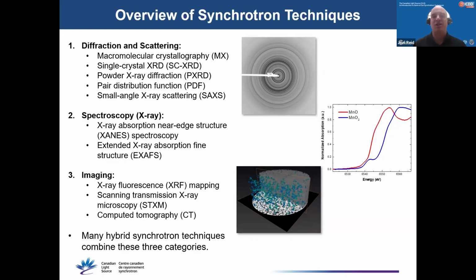Many of these advantages of the synchrotron also lend themselves to hybrid techniques, which blur the lines between these three categories. So I've tried to create some relatively short examples. Some of them are industry-based and some drawing on peer-reviewed research to highlight some of the things we do.